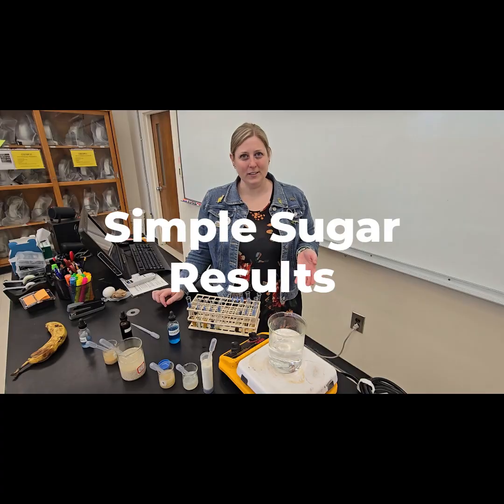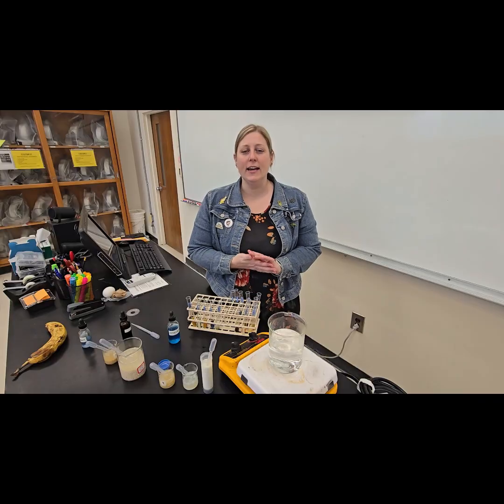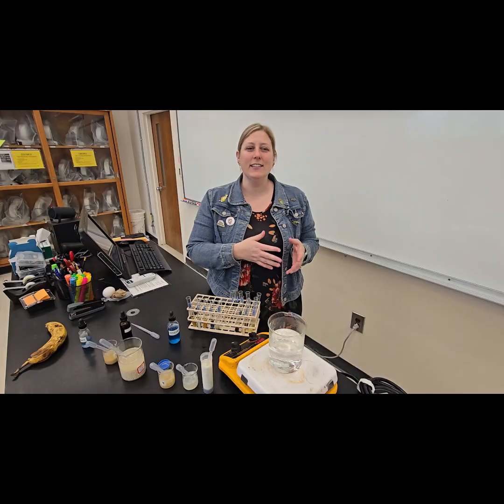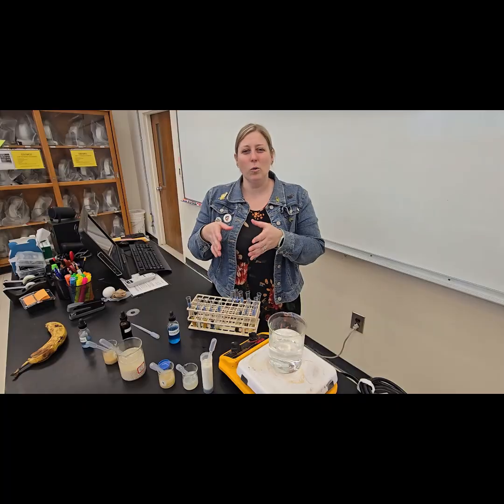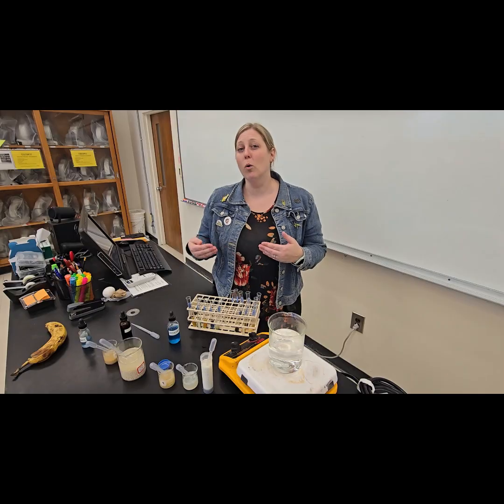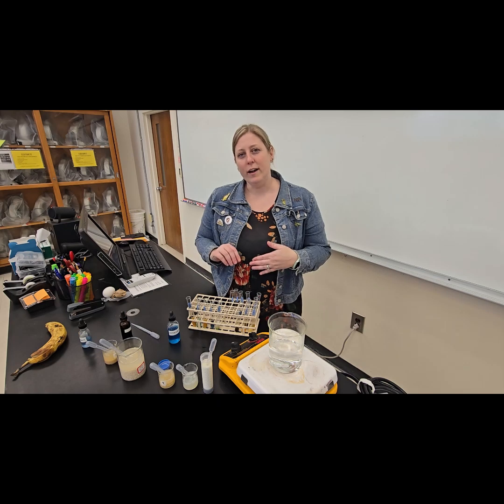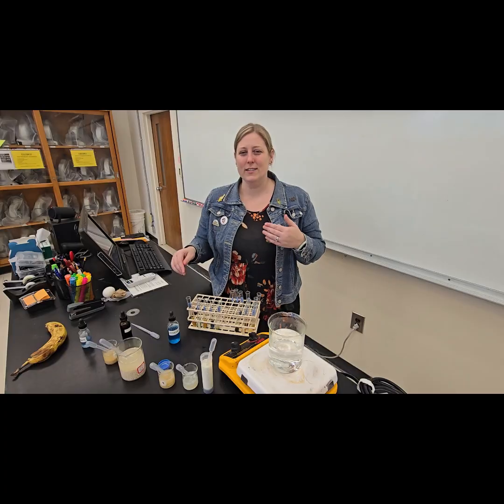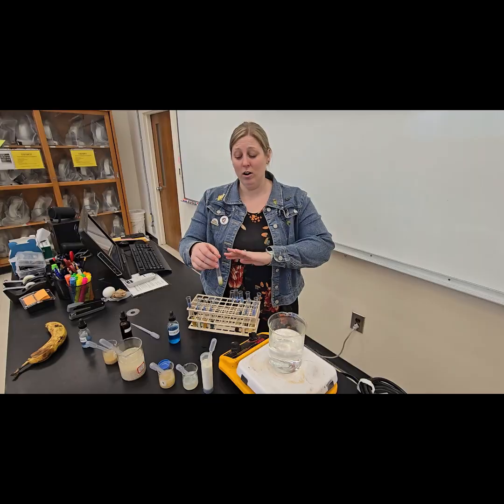All right, so we let our Benedict's solution run for another 5 minutes in the warm water bath. And with Benedict's solution, we can get a range of colors as a positive result, where if we see anything that's kind of a yellow-green all the way up to a really bright red, so like yellow-green to orange to bright red, can tell us the presence of sugars. And it can indicate that there's more of those sugars present with the brighter color response we see. You also have to consider that we are adding this to some colored foods, and so we might see some results that we have to interpret based on the color of the food itself. So with that being said, here are the results.